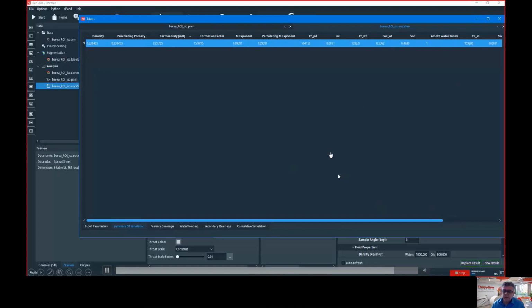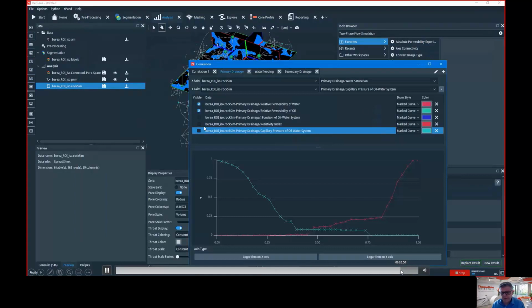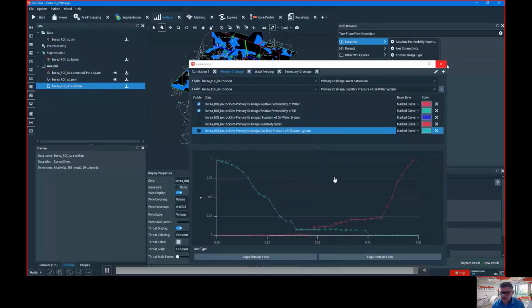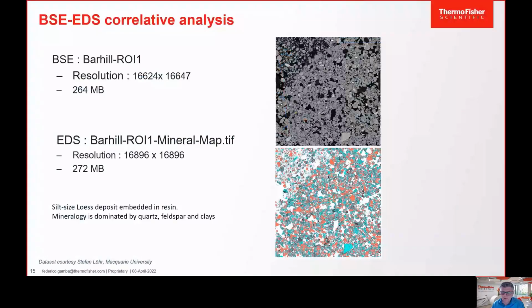So this is a quite powerful simulator indeed, and it's PerGeos only, because it makes sense. PerGeos was born for digital rock specifically, so this is why this simulator is only in PerGeos. And I saved the project, and that's it. I think it's finished. Okay, so that was the demo about two-phase flow. I think I go on to this second topic.